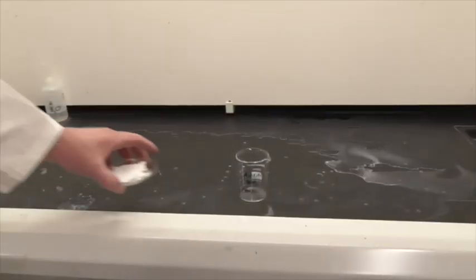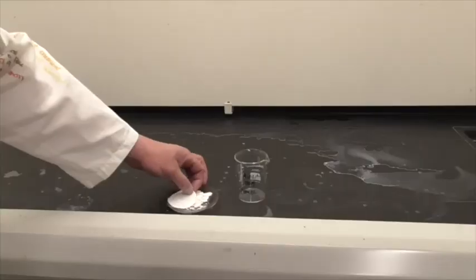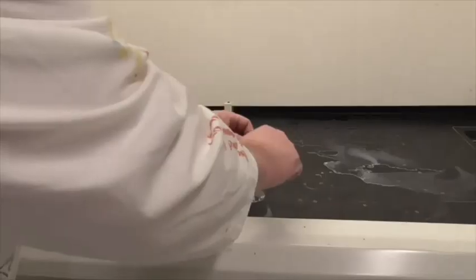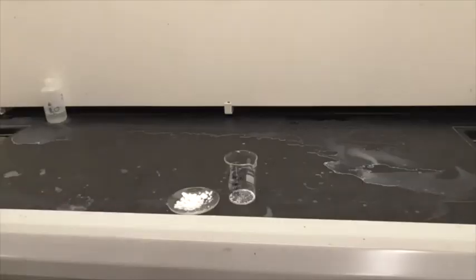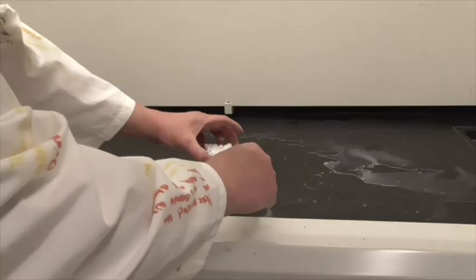All right, so the last thing we need to do is get rid of our aspirin. I can't put it down the sink, so what we have here is just a beaker that I'm going to scrape off the filter, get all the aspirin off the filter as much as I can, and then throw that in the trash. And I'm going to push the rest of our aspirin in there.